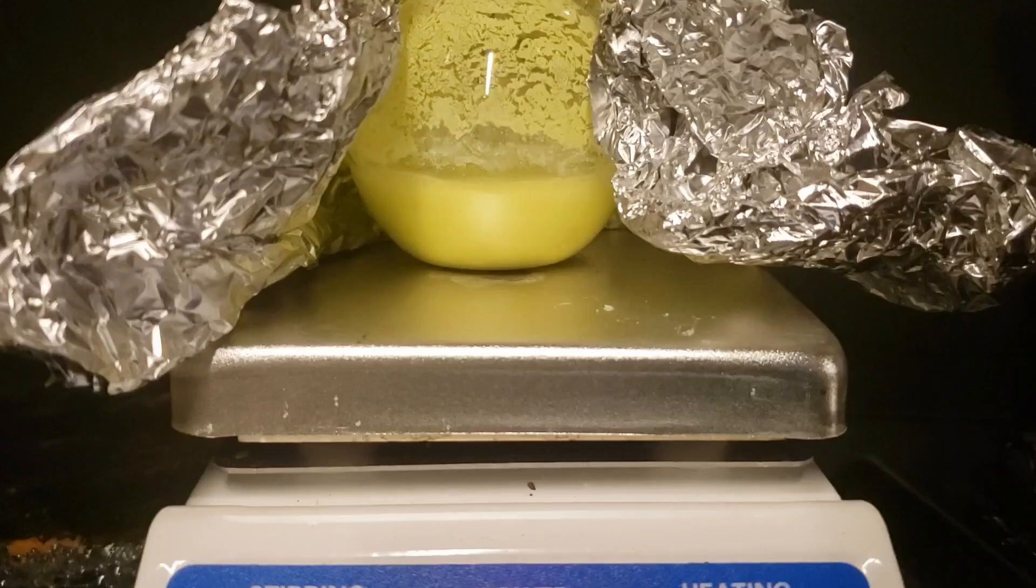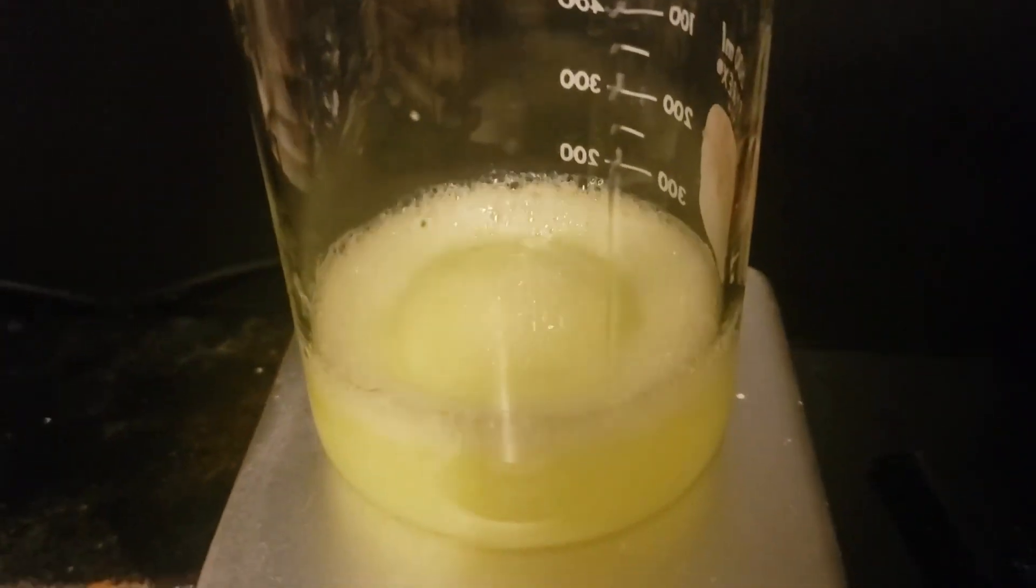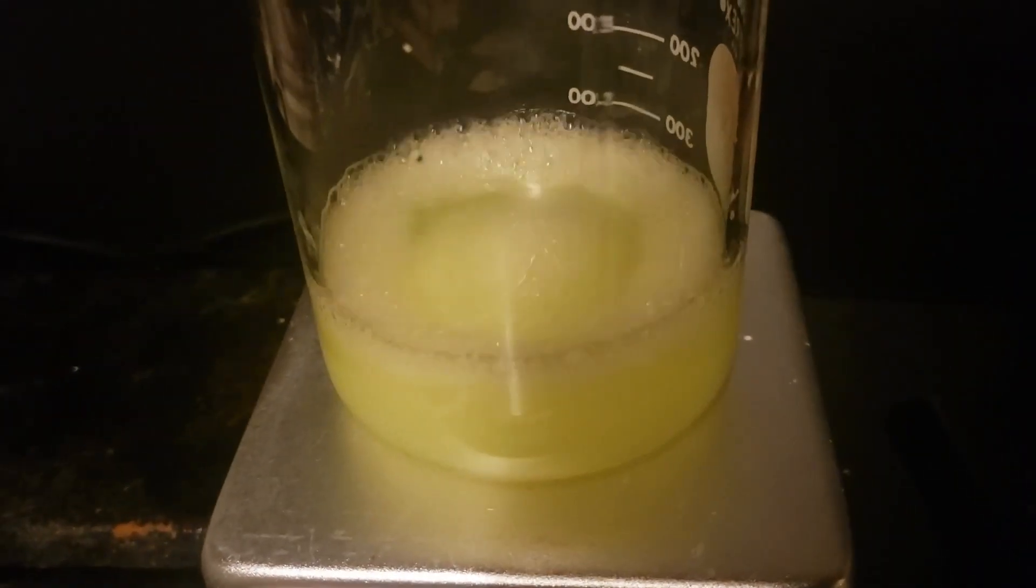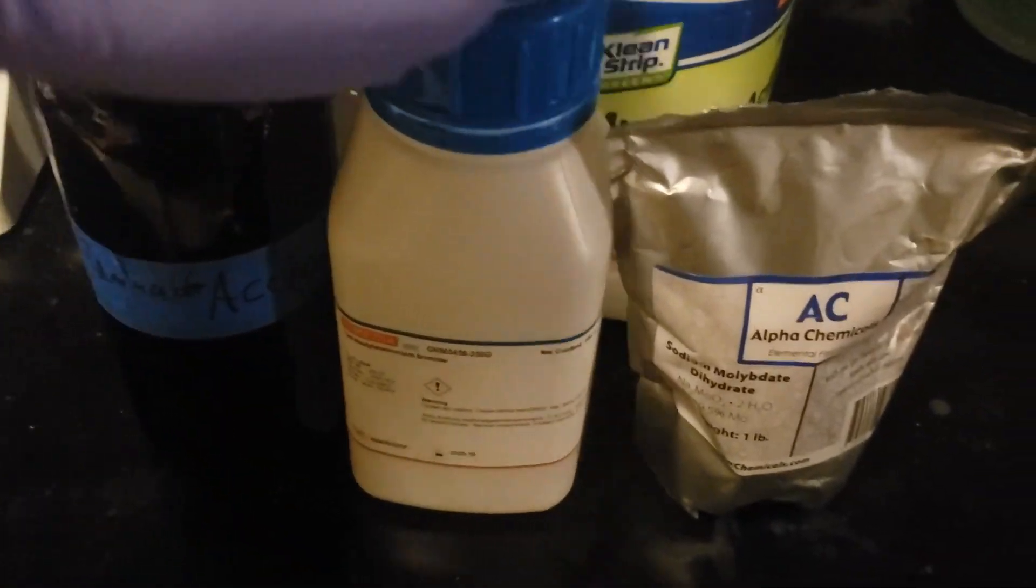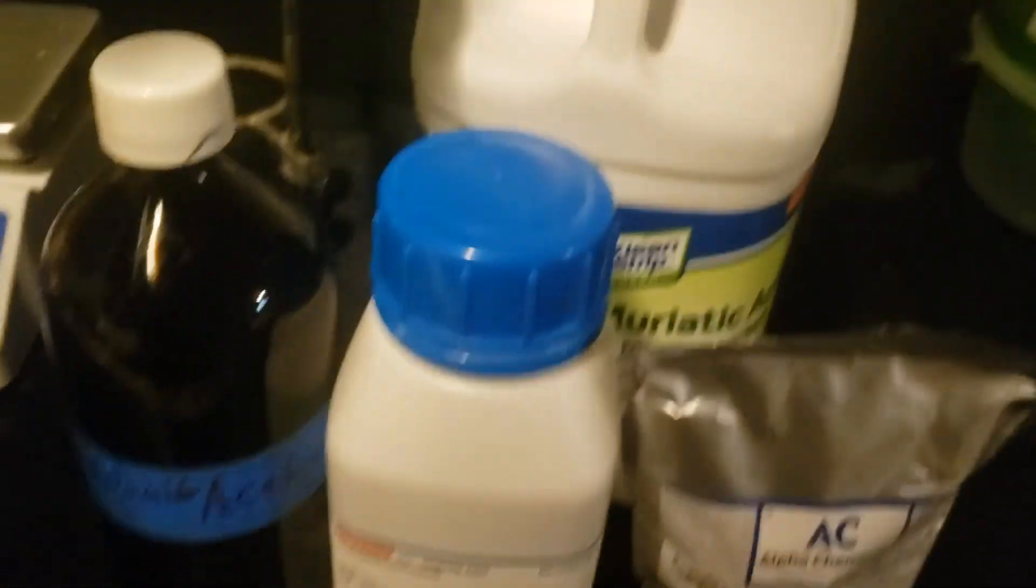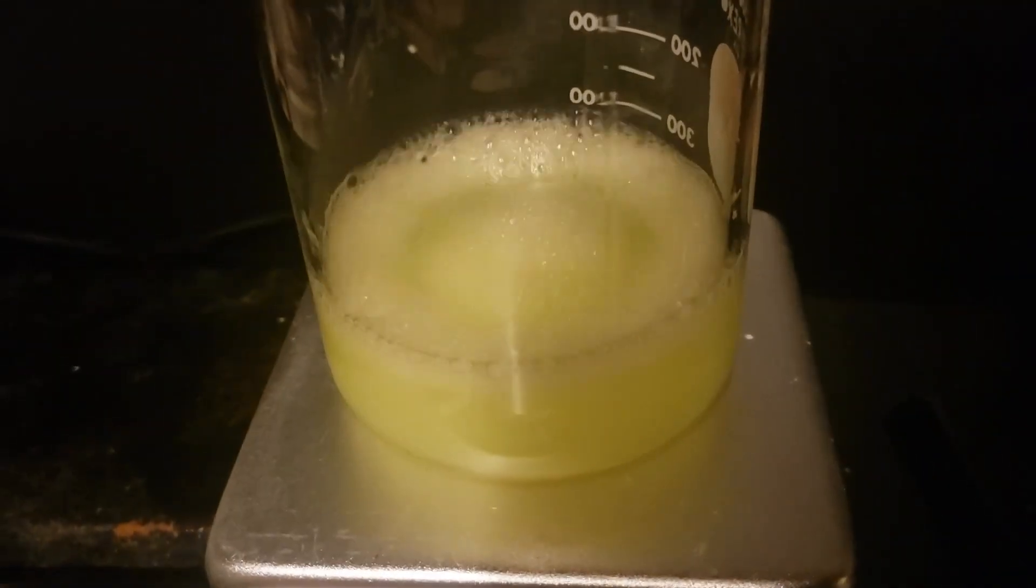Hi everybody and welcome back. Today we're going to be making tetrabutyl ammonium hexamolybdate, an interesting yellow polyoxometalate salt. For this experiment, you will need acetone, tetrabutyl ammonium bromide, sodium molybdate dihydrate, and 20% hydrochloric acid. So without further ado, let's get into it.